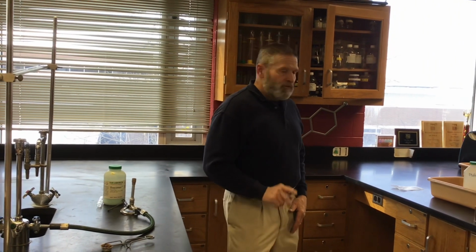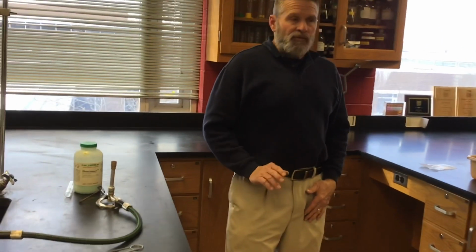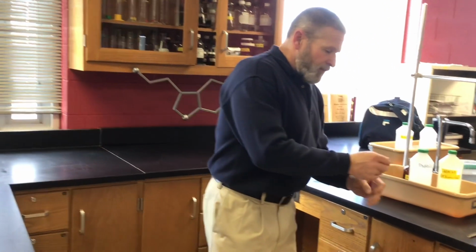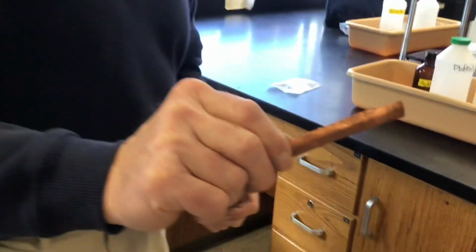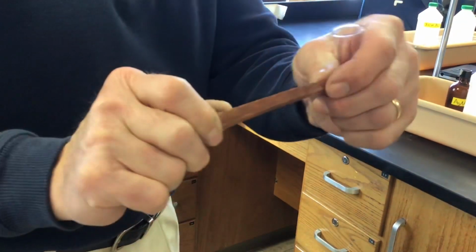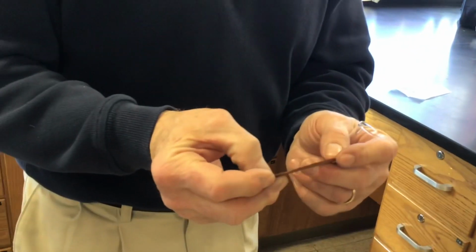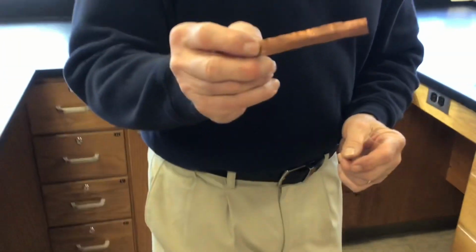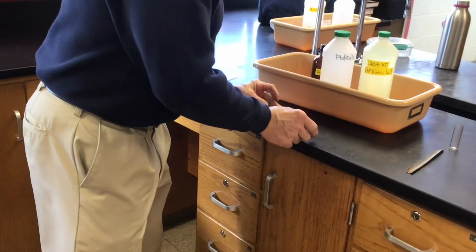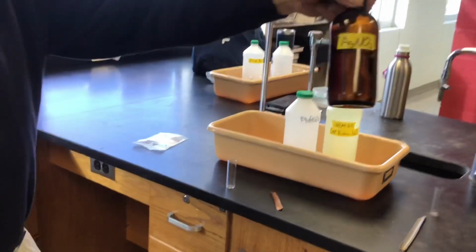So what I'm doing, for the most part, is going in order here, but we are showing you step 4 first, just so you can see the before, and then later you can see the after. Step 4 of the lab talks about reacting copper metal, and we have some copper foil here, a very thin sheet of copper metal. The paper says use copper wire, but this is fine. What you basically need is copper metal, and then we're reacting it with aqueous silver nitrate.